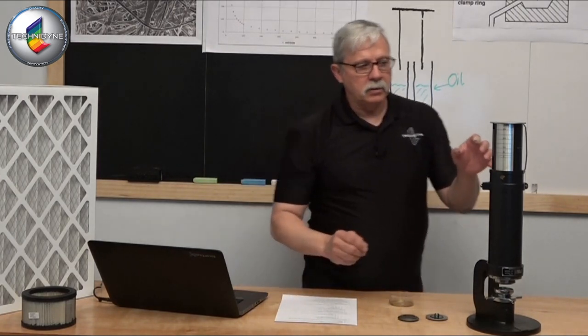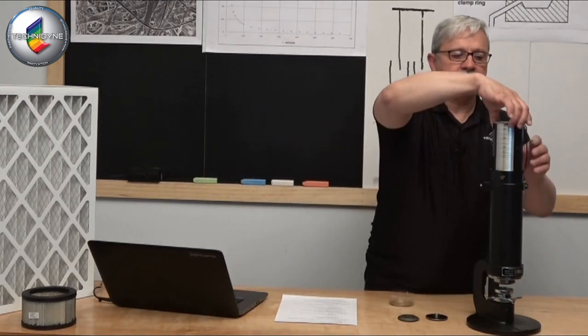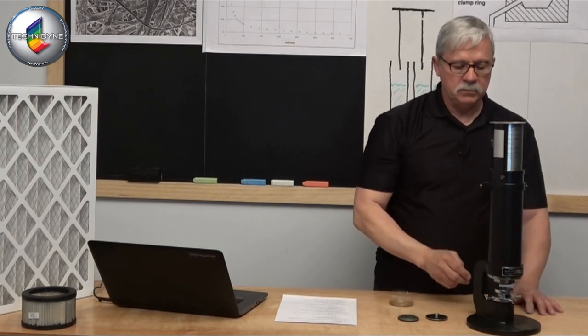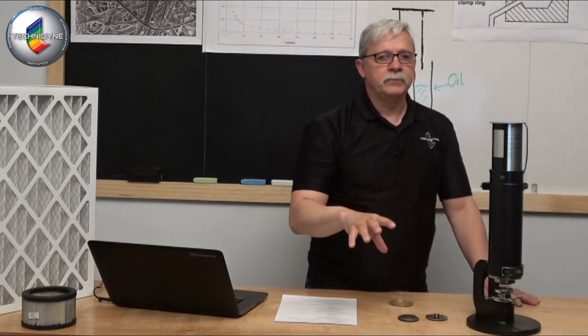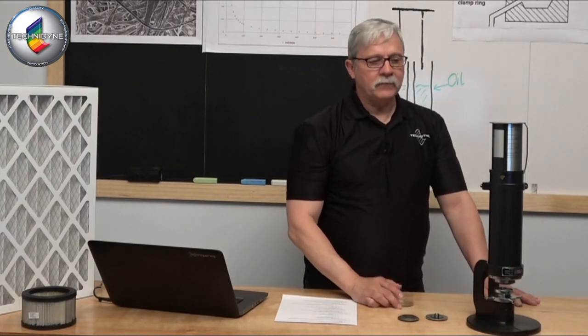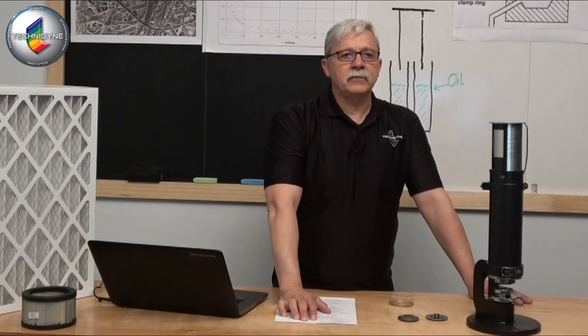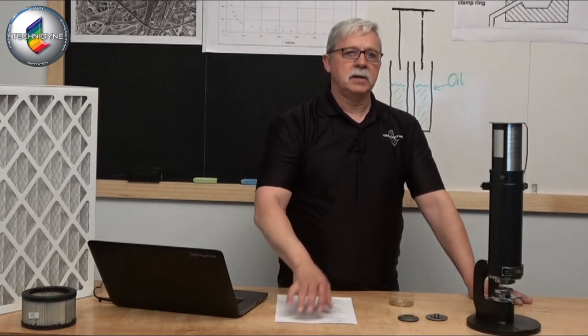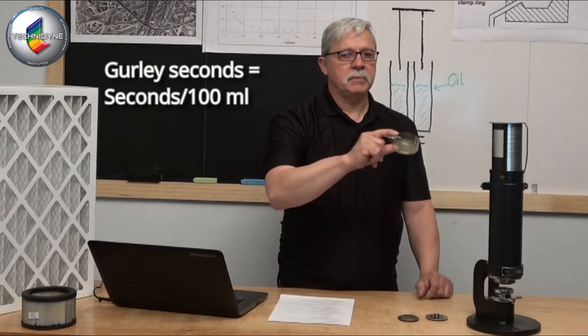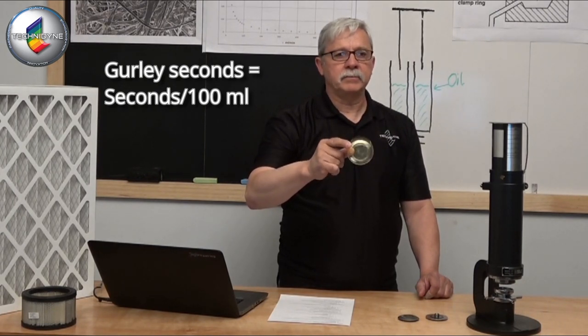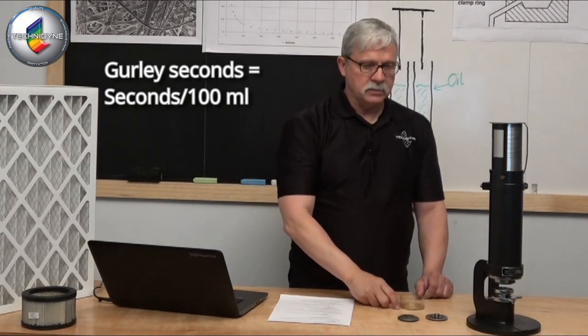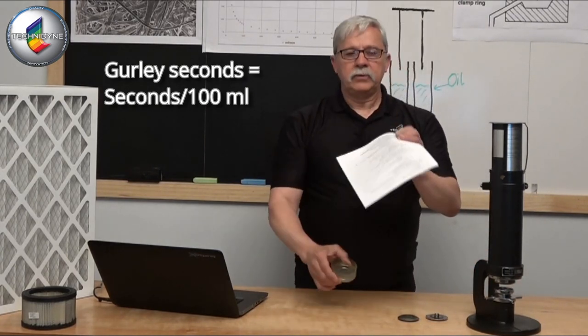So there are gradations on this cylinder here that help me define, as this travels into the center circle, the volume that's going to be moved through this particular sample that I have in place. That volume, the early definition for that volume was 100 milliliters of air. How many seconds does it take to move 100 milliliters of air through that sample? Just to give you an idea, this small cup here is 100 milliliters in volume. It's not a lot. There's not a lot of air to move through there.